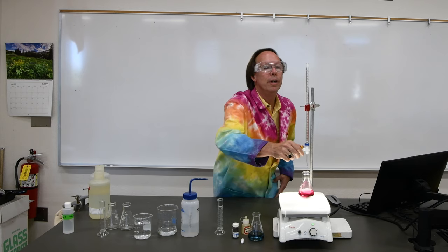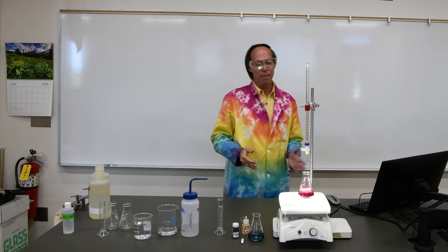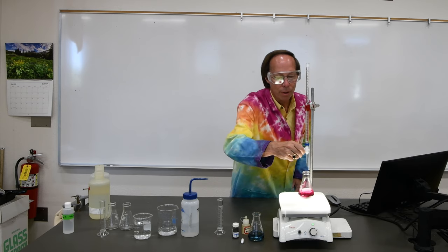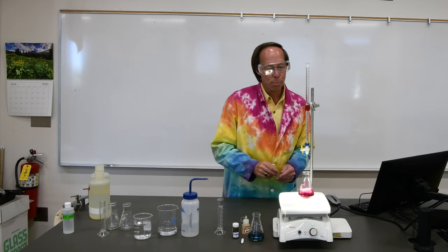So there's one, two, three, four, five. That's about 5.5. So let's go ahead now and start doing it a drop at a time again, like we did before. And we'll watch for that color change. It should again turn purple, and then one drop later, it will turn blue.